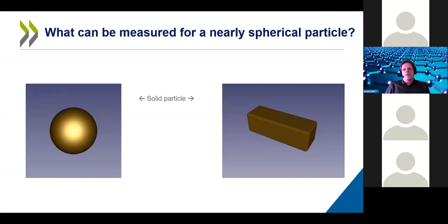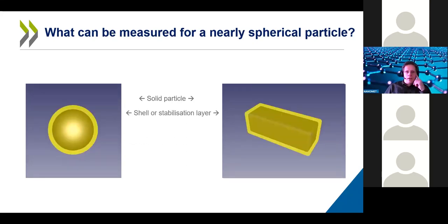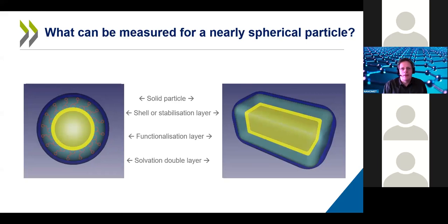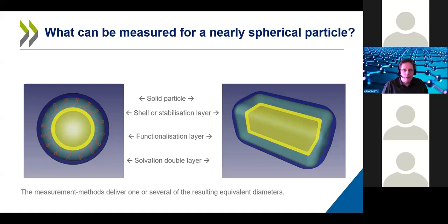Within TG 125, proposed diameters carry two indices: one for the quantity type and one for the measurement principle. For example, atomic force microscopy measures the height of a particle above a substrate — the equivalent circular diameter is based on the height only, not the lateral dimensions. Each other method listed has a different measurement principle and thus a different index. This index system allows users to differentiate which method was used to determine a specific diameter.